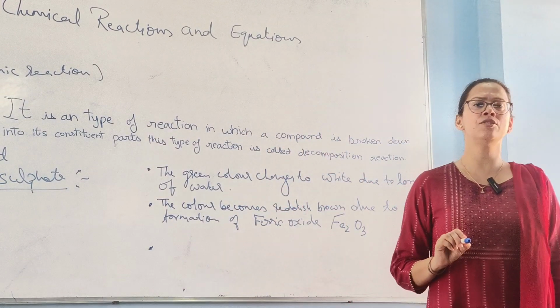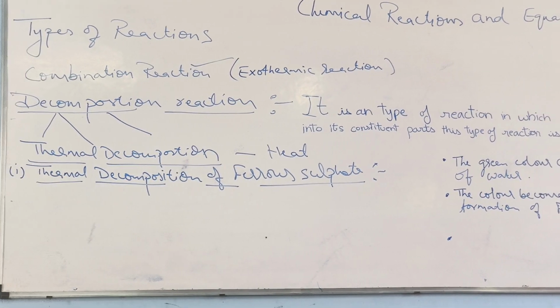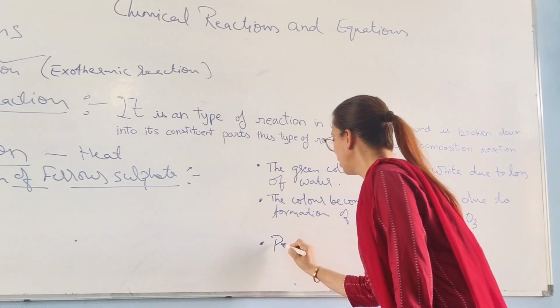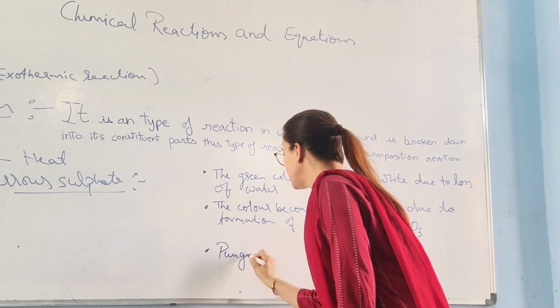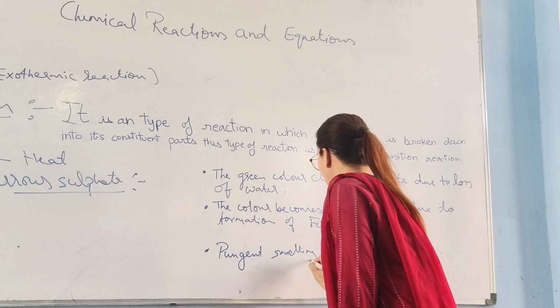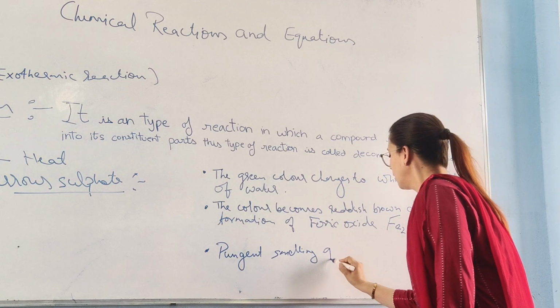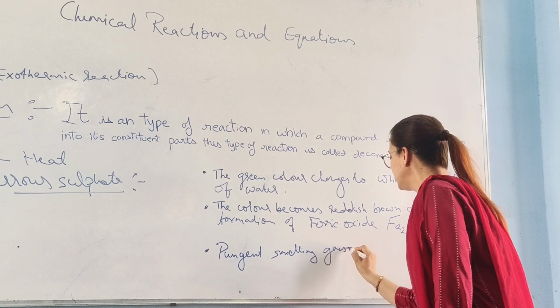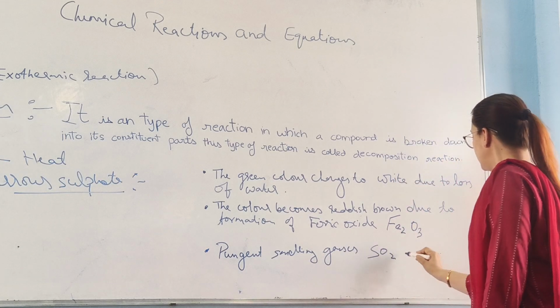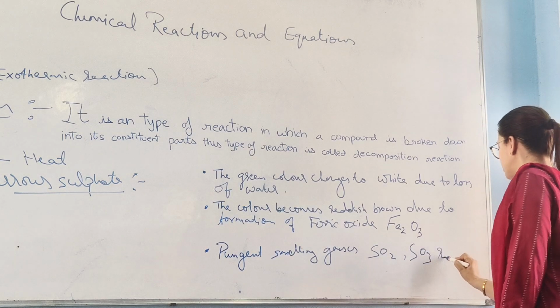And then we also get gases of pungent smell. What smell? Pungent smell. Pungent smelling gases, that is SO2 and SO3, released.